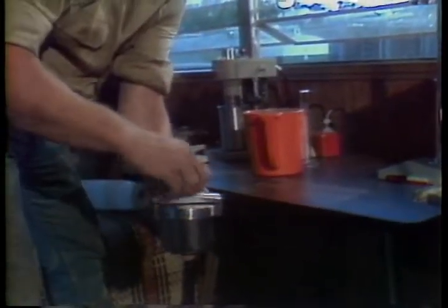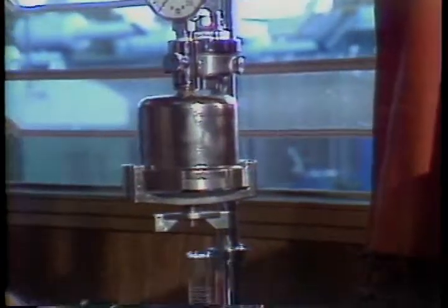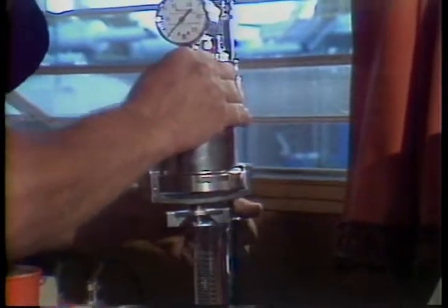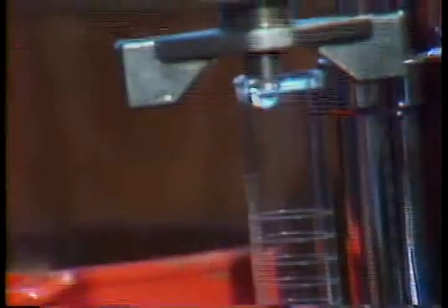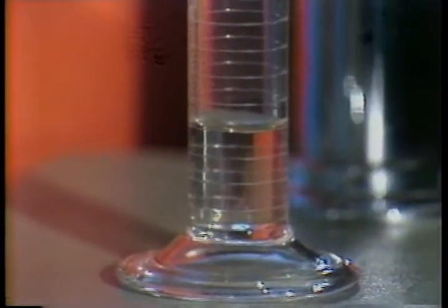Under a pressure of 100 pounds per square inch, the mud is strained for 30 minutes. Before too long, the mud particles are going to try to clog the filter paper and slow the flow of liquid that's squeezing through. The amount of filtrate, or filtered liquid, is measured and recorded.